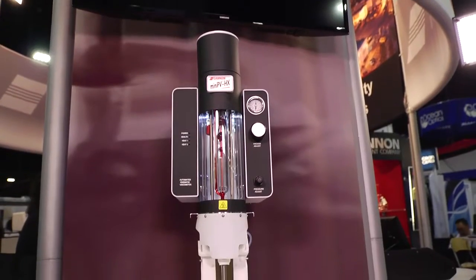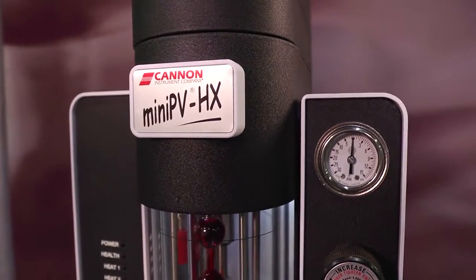You're able to link up to four systems to one computer using our powerful VISPRO software, which will allow you to test multiple temperatures, viscosity ranges, methods, lids, and use different solvents all consecutively.